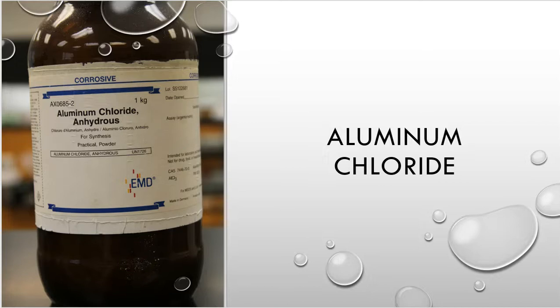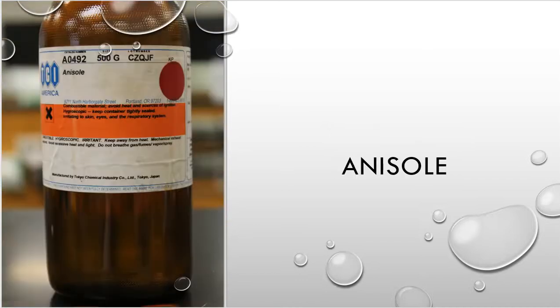Finally, we need anisole, and anisole is this substituted benzene. This substituted benzene is a liquid as well. This comes from TCI America. That is the manufacturer with this. And the lot number is up here in the top right-hand corner: C, Z, Q, J, and F. So pretty short and sweet lot numbers that TCI America decided to use on that bottle. This one is just a clear liquid. It does have an odor, but it's that traditional organic odor that you're always going to find in an organic laboratory. Very diesel-y smelling or some kind of petrol smelling type of compound. So nothing special out of the ordinary for anisole here.